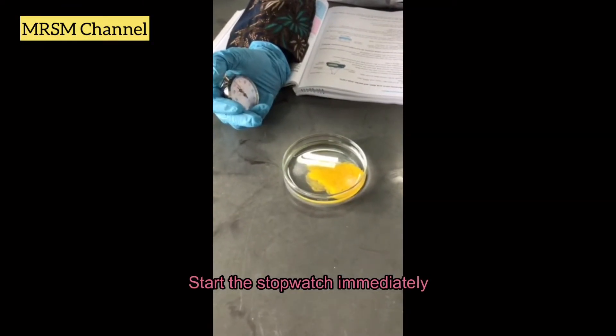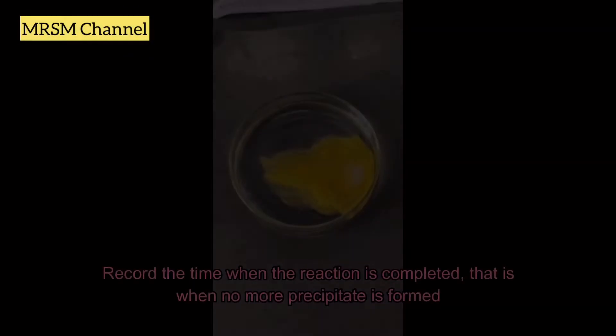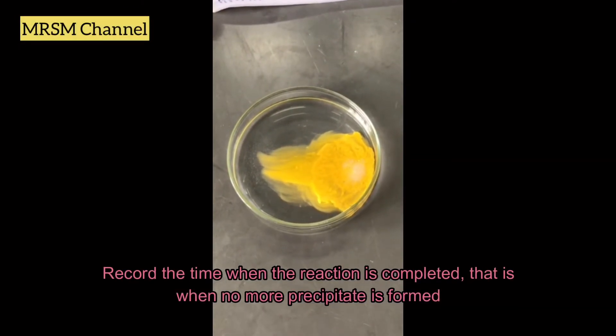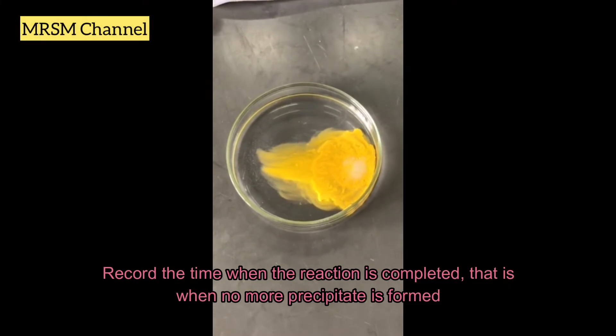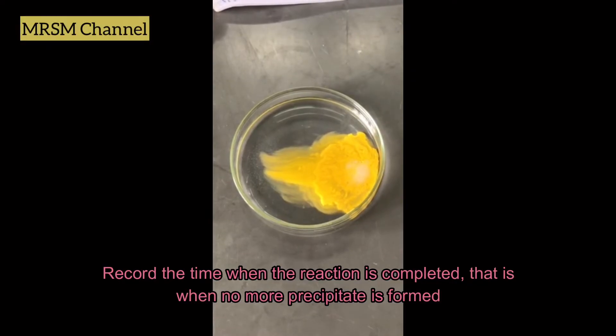Start the stopwatch. For step number six, you should record the time when the reaction is completed — that is, when there is no more precipitate forming.